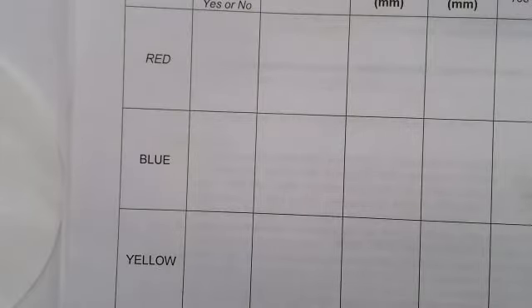All right. Also at your station is a beaker that contains capillary tubes. Capillary tubes are just really narrow straws, if you will. And these are glass. The original capillary tubes were about 6 centimeters long. You don't need them that long. So I broke them. So be careful because one of the edges will be a little sharp. So whenever you're grabbing them, definitely handle them from the middle. And you'll get a capillary tube for each of the colors. So you've taken all the M&Ms out. Now you're ready to prepare your chromatogram.